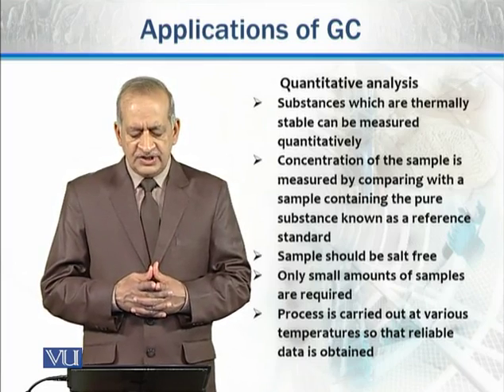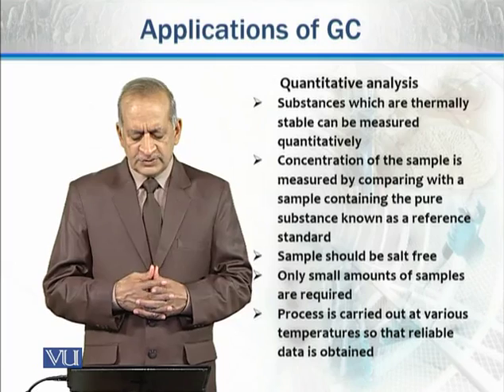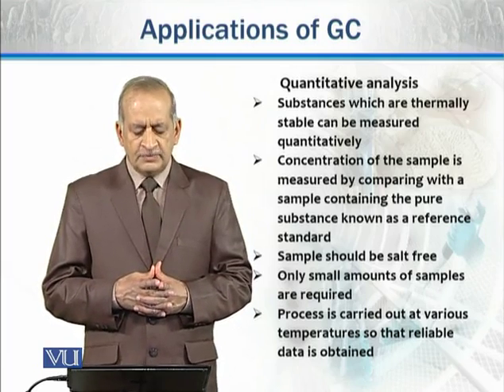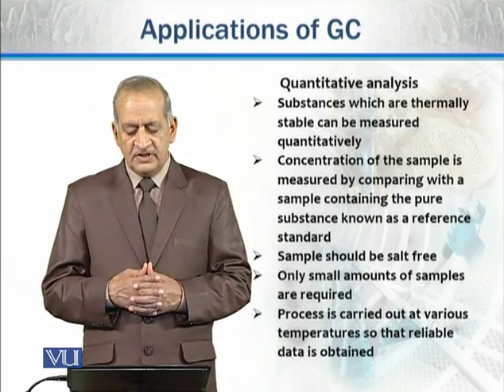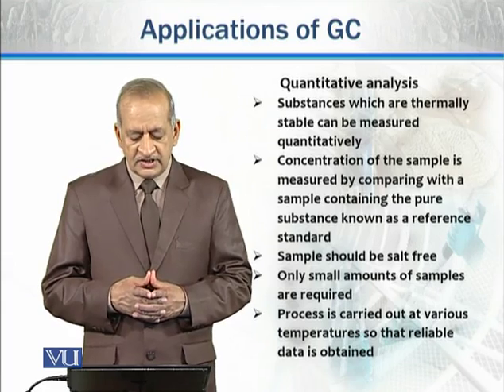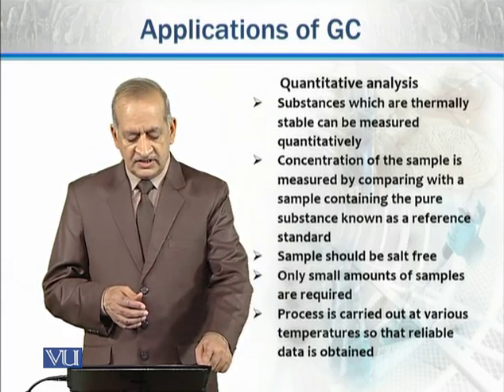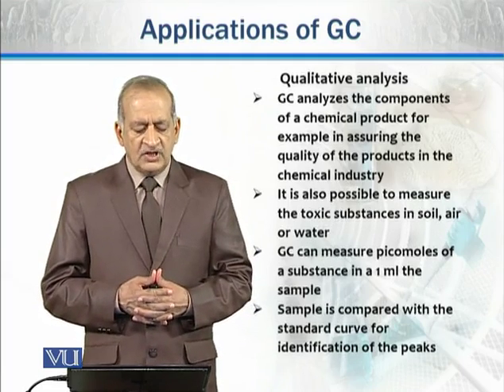The sample which is used here must be salt free and oil free as well, and only a small amount of sample is required for quantitative analysis through gas chromatography. This process is carried out at various temperatures so that reliable data is obtained. This can also be used for qualitative analysis.